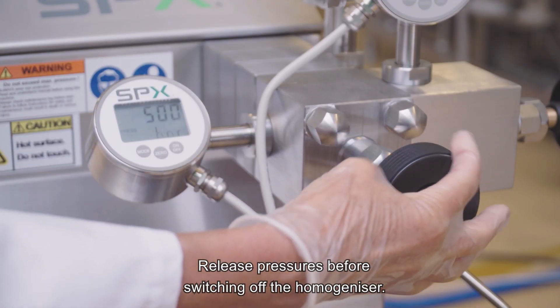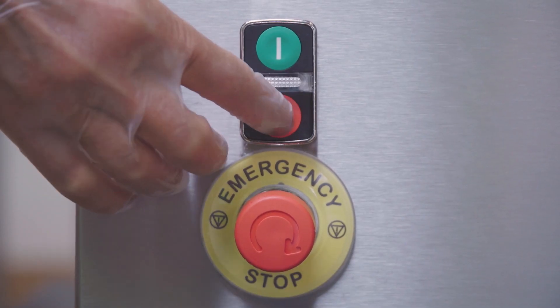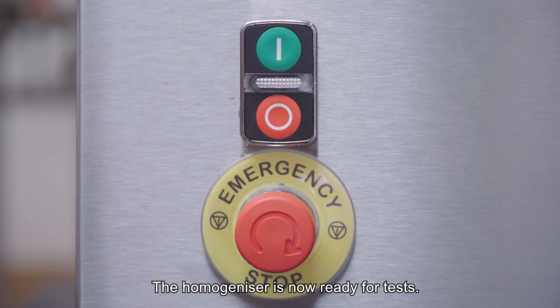Release pressures before switching off the homogenizer. The homogenizer is now ready for tests.